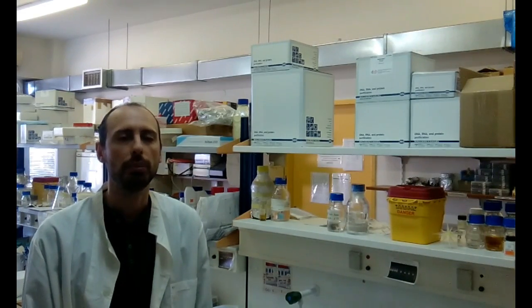The taxonomy of each OTU was based on Bergey's Manual of Systematic Bacteriology, while uncultured organisms were classified according to the taxonomic outline maintained by Philip Hugenholtz. The remaining sequences were used to design the probes.